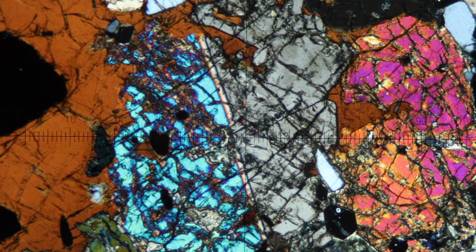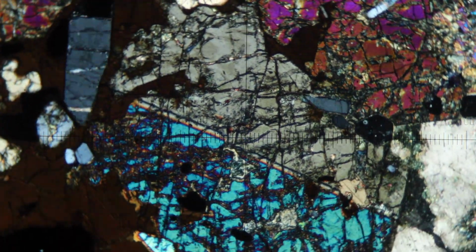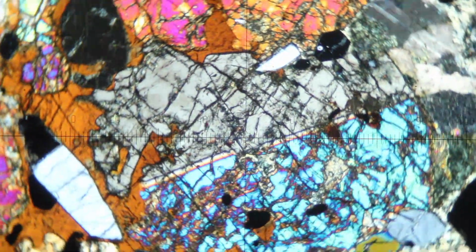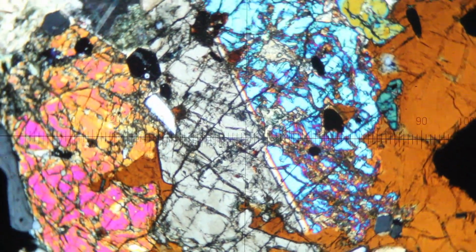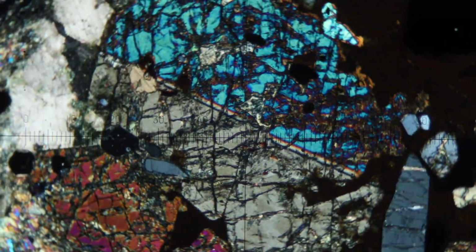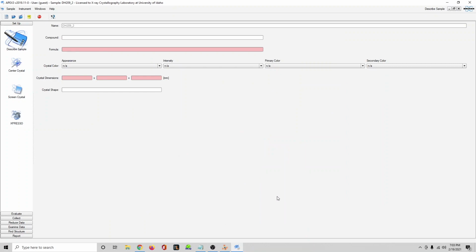I wanted to go through an example of a crystal structure refinement of a pyroxene because it's a good example of a basic type of disorder, being a split occupancy. Pyroxenes also have a lot of chemical substitution within the same crystallographic site, so it makes for a really good example. So what I'm going to do is open up, so I have the file open already here.